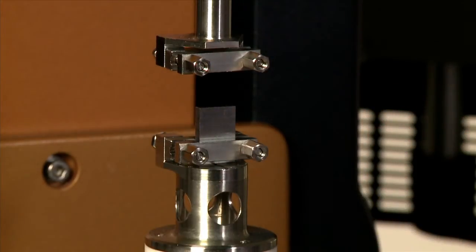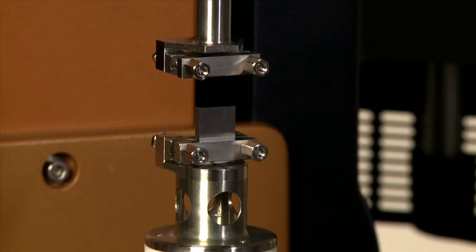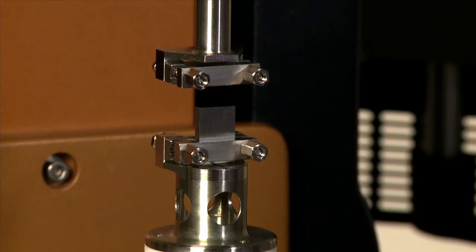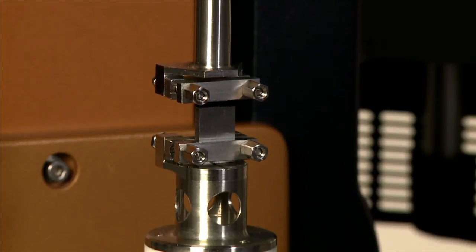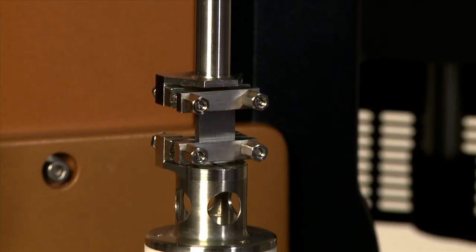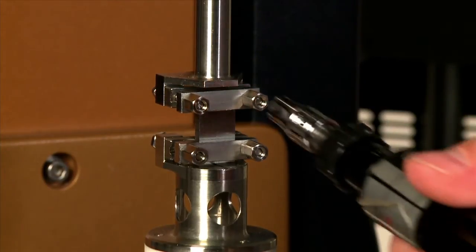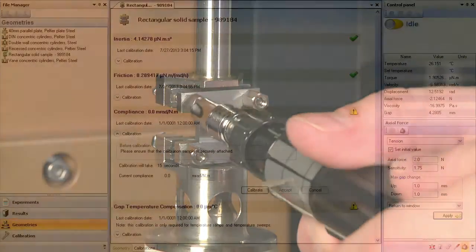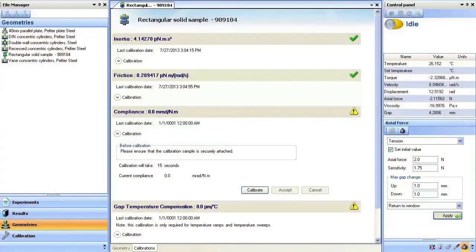Lower the upper head over the sample and again tighten into place. With the steel compliance sample torqued in position, you must apply an axial force.